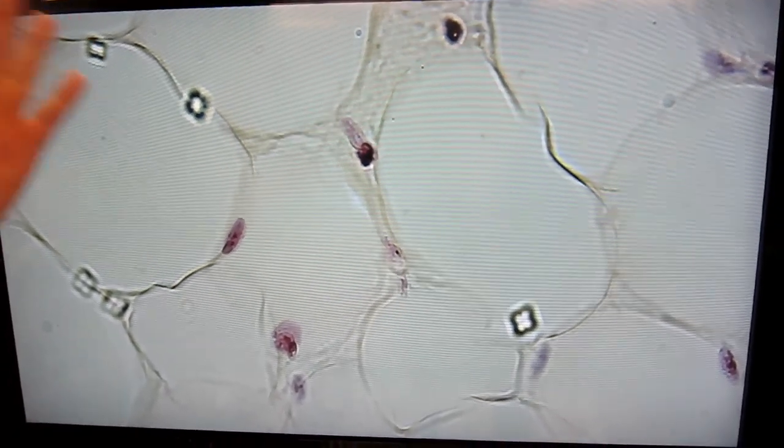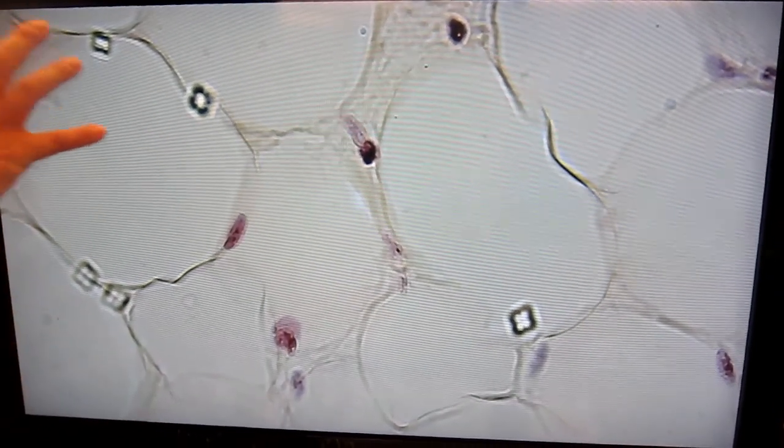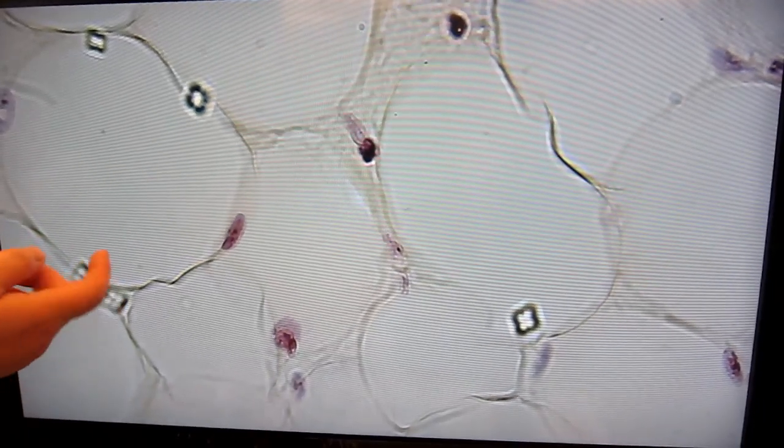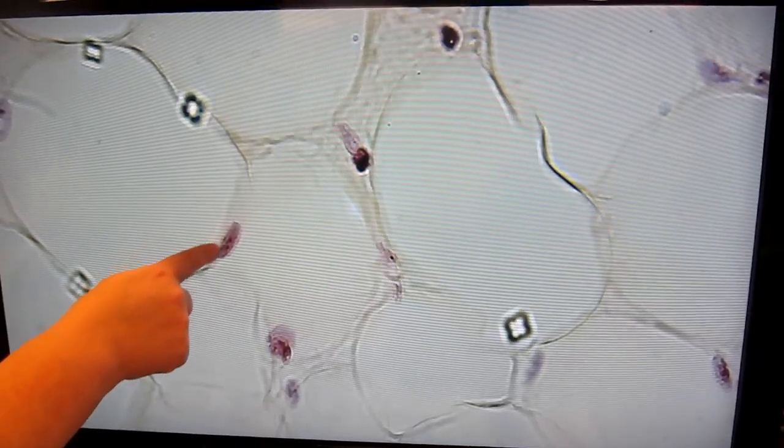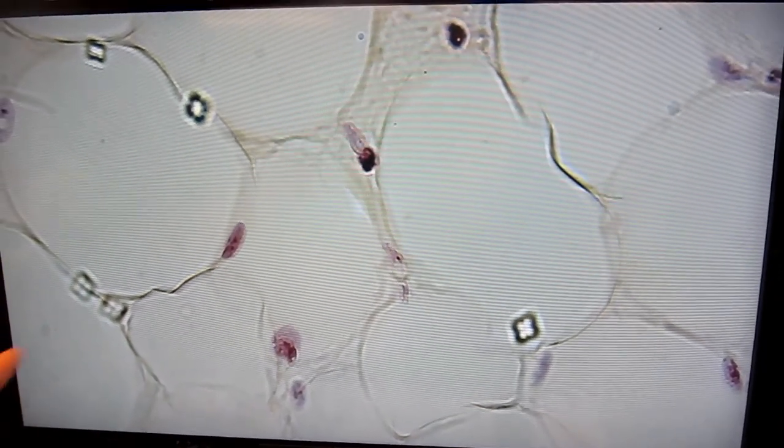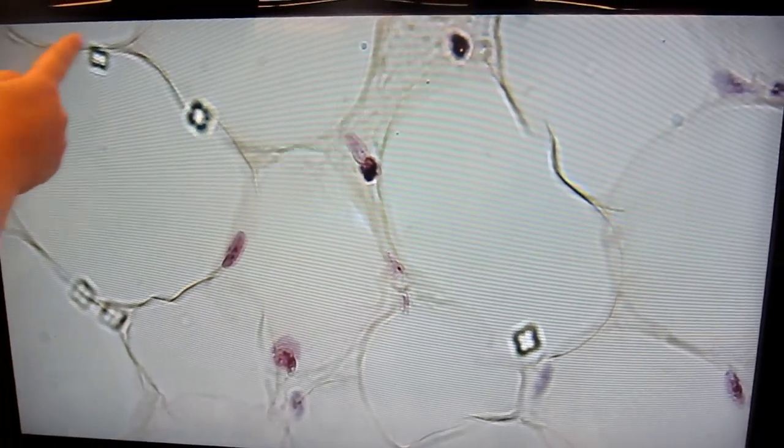Now there's really nothing in there because of the preparation process. But you can see that since all the space was taken up by the lipid, there wasn't much room for anything else, including the nucleus. So when you do find an adipocyte that has a nucleus in it, the nucleus is always pushed right out to the edge of the cell.